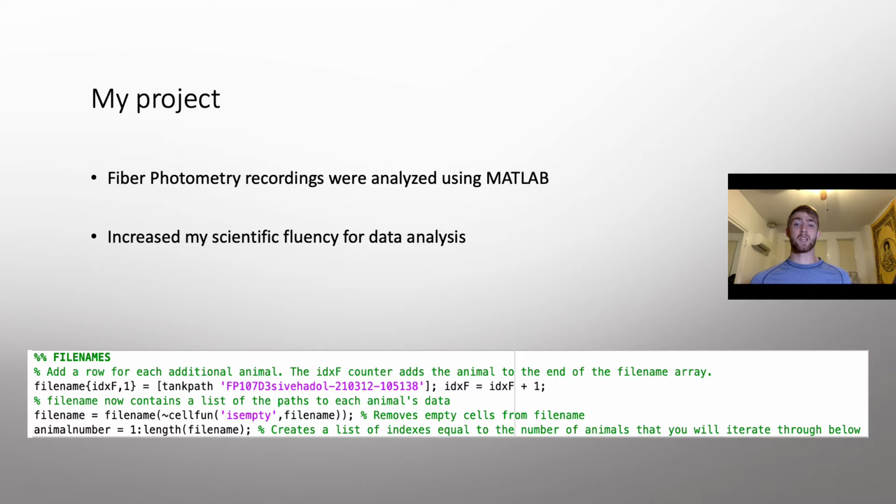So at the beginning of my experience, I was working with photometry recordings, which are large data files, unorganized. The process is to organize this data using a program called MATLAB, which runs on the coding language C++. And that's what's there down at the bottom, a little clip from the files I was inputting into the program to get a more readable version of the data.